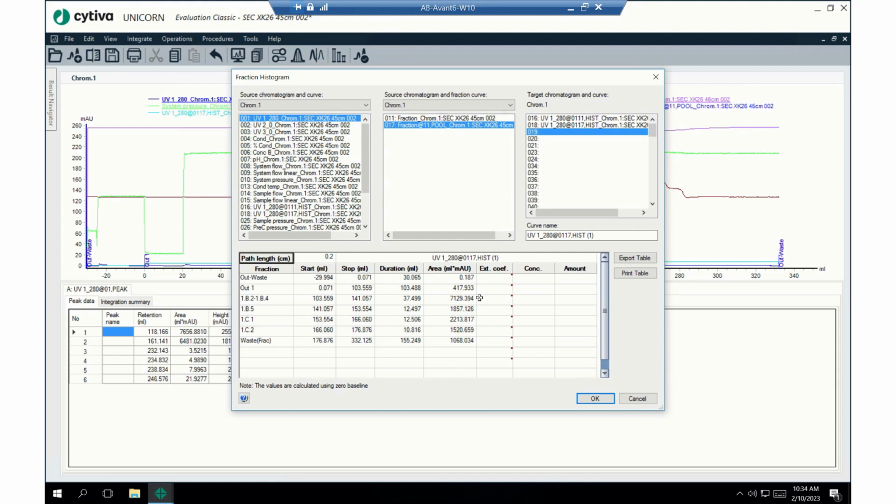So that's this guy. And what was the number again? I've made a couple of these videos, practiced making them, and every time I do it I forget the number. I know it's 0.7 and I think it's 4.2. I think a couple times I've said 6.2, but it's 0.742.